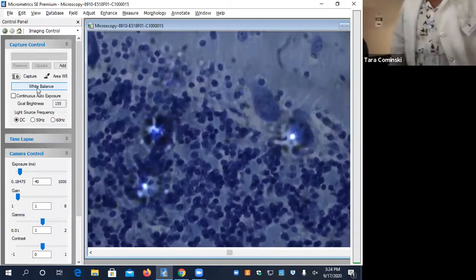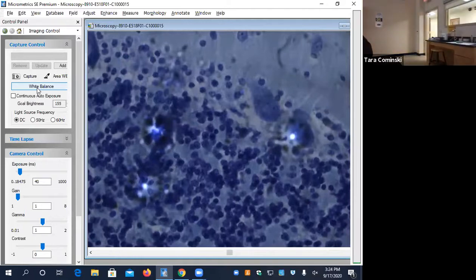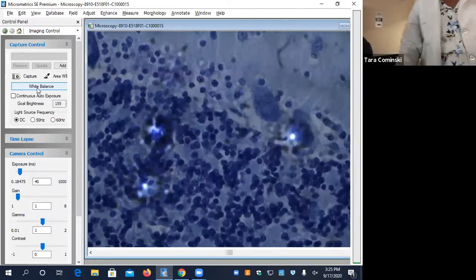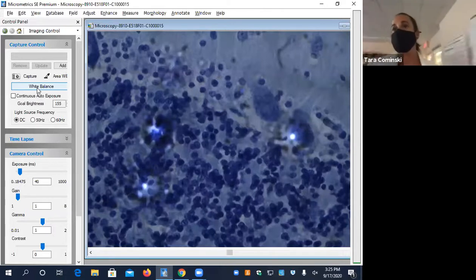All right, so you guys are done. You completed everything. Just draw the onion cells, the best you can. It's not really about accuracy, it's just proof that you did it. For those of you on Zoom, they're just drawing what they see for the onion cells. We're not doing the cheek cells.